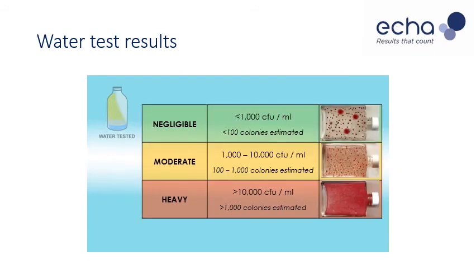This table shows the number of CFU which indicate negligible, moderate, and heavy levels of contamination. These limits are those published in the IATA guidance material on microbiological contamination in aircraft fuel tanks, but they are for guidance only. Users can always choose to set their own contamination limits based on their experience. The Micromonitor 2 test is very flexible in that respect.